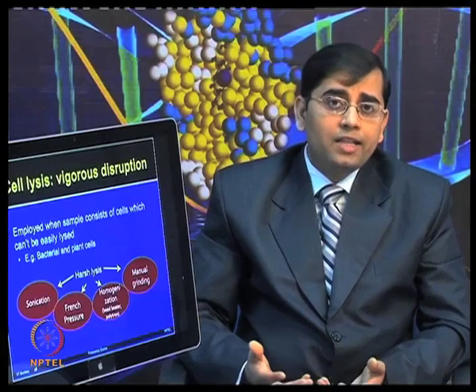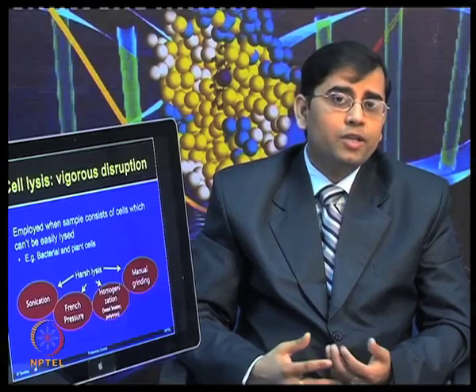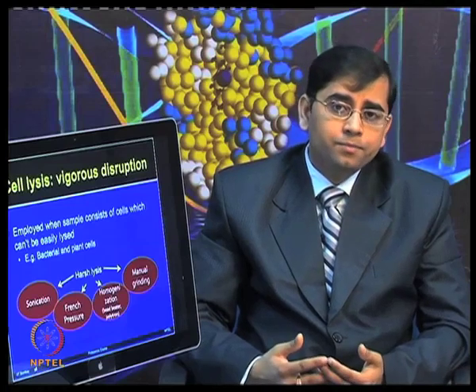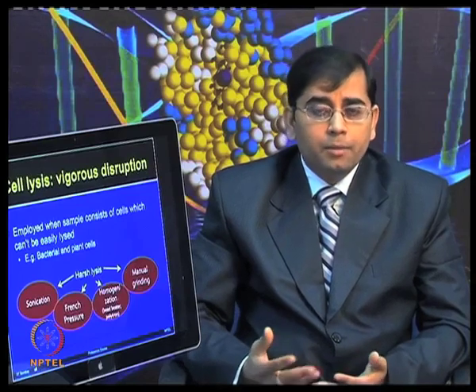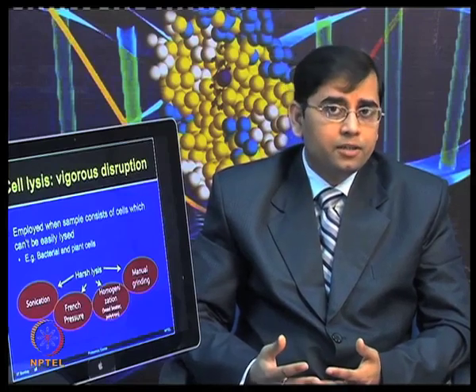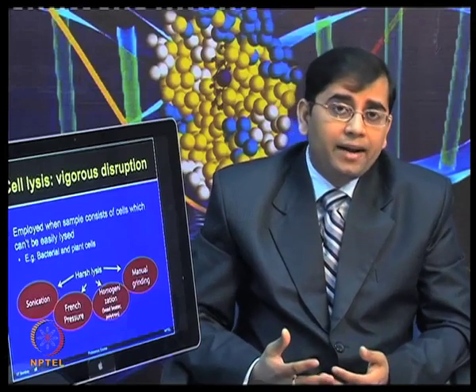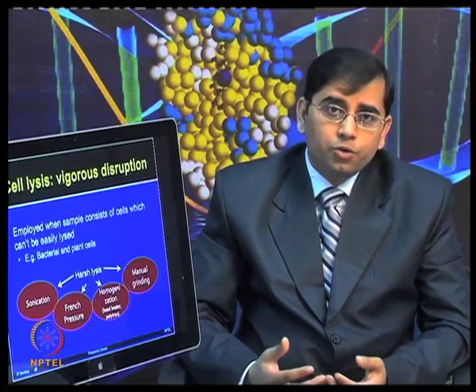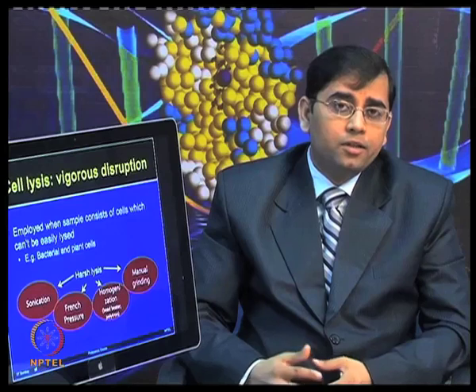But in all sample preparation, mostly people use manual grinding or homogenization by using bead beater or polytron homogenizers. So, these are very commonly used homogenization methods. The manual grinding is performed by using mortar and pestle. Often it is very efficient, but if you have very little sample and you want to avoid any contamination, or you have some samples which are going to pose challenges with mortar and pestle, then you need to use the electronic homogenizers.